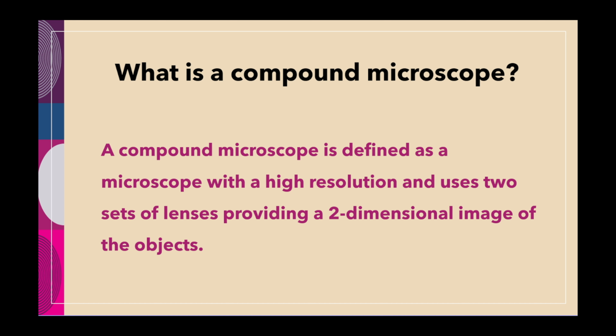The next question would be: what is the compound microscope? A compound microscope is defined as a microscope with high resolution and uses two sets of lenses, providing a two-dimensional image of the object.